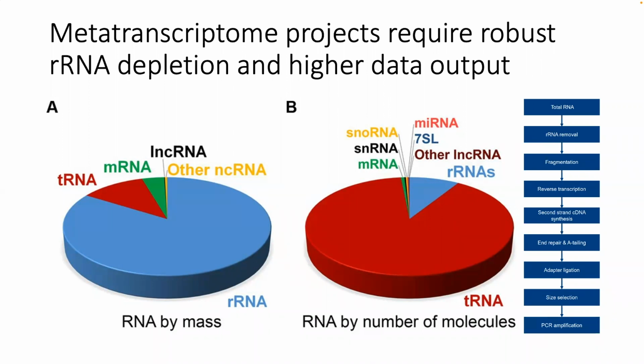This can be species dependent, depending on the enzymes that are being used. So if you have incorporation of a fragment that's 150 base pairs versus a fragment that is 75 base pairs, you will see a dramatic skew towards your 75 base pair, just because, as mentioned earlier, of the clonal amplification on the machines themselves. So balanced libraries, always a good idea.